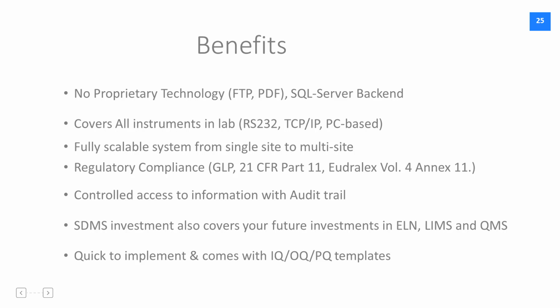The system has a controlled access to information with Audit Trail facility. Your SDMS investment will cover your future investments in ELN, LIMS and QMS as well. The data inside SDMS can be provided to these external systems, so your investment doesn't go or stop at SDMS.